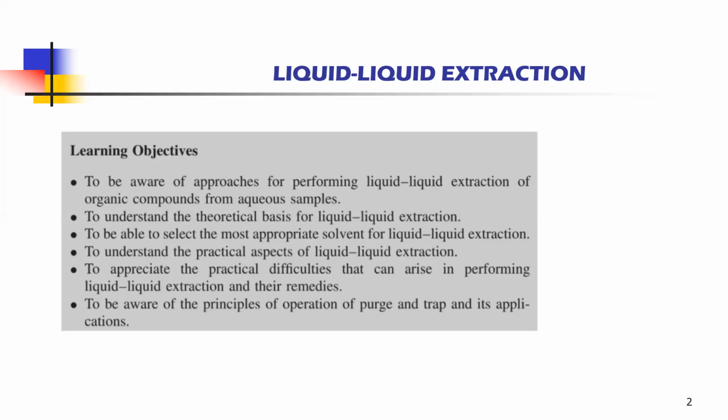We are going to have more focus on the theoretical background, and we have already learned about solvent extraction in the lower classes. So this gives us the idea about the underlying principle. We are going to learn about the practical aspect of liquid-liquid extraction further in this chapter, and to appreciate the practical difficulties that can arise in performing liquid-liquid extraction and their remedies. What are the solutions to overcome these difficulties, we are going to see.